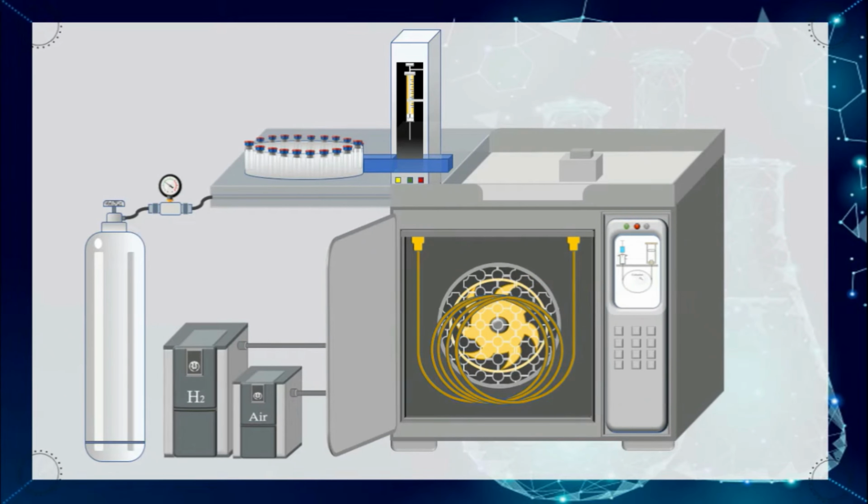So here is the autosampler. It can be of different types like split and splitless. This is the carrier gas inlet. This is the autosampler. This is the septum. First of all, carrier gas is passed through it. Then we apply the sample, and the sample has been applied. So this is the split outlet. In the split process, usually gas and sample are separated. But whenever it is closed during the splitless method, then the carrier gas and the sample will pass through the column. So this is the basic difference between split and splitless.